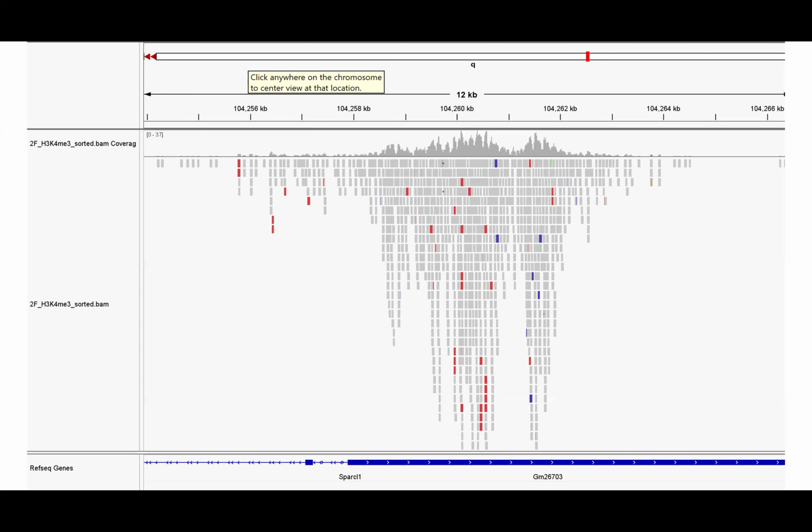So I think that's the first step I would recommend for these sort of data: if you know anything about your targets, see if things are making sense. Particularly, usually H3K4 trimethylation is recommended as a control for a lot of these experiments because it has well-defined localization to gene promoters. So check, is H3K4 trimethyl at a gene promoter? Is it in genes that I would expect in my sample of interest? And is it absent from genes that I wouldn't expect?